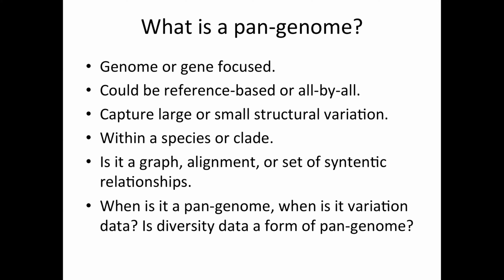About what Suk was saying and what Gramene was trying to do at that early level is a pan-gene atlas. Well, what is the cumulative set of all the genes present in the genus or in a species level? That is a pan-gene atlas. So those two are different things, I guess. But I've seen that many of the pan-genome papers have basically used the synteny and the gene trees to draw the pan-genome graph in that way.